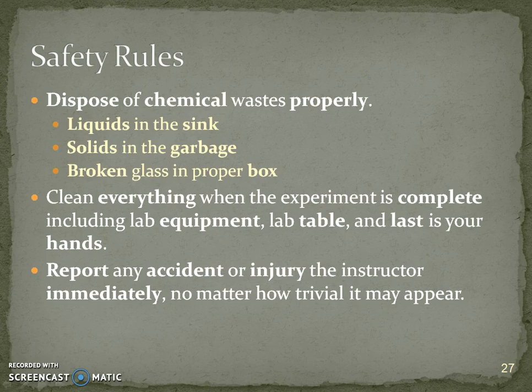And that last bullet, very important. Report all accidents and injuries to me immediately, no matter how trivial they may appear. We want to make sure that we get everybody safe. And if you need anything or if I need to replace anything, I do not get mad at accidents or injuries. I make sure that everybody is just safe. And then if there's any consequences I have to deal with, I deal with it afterwards.